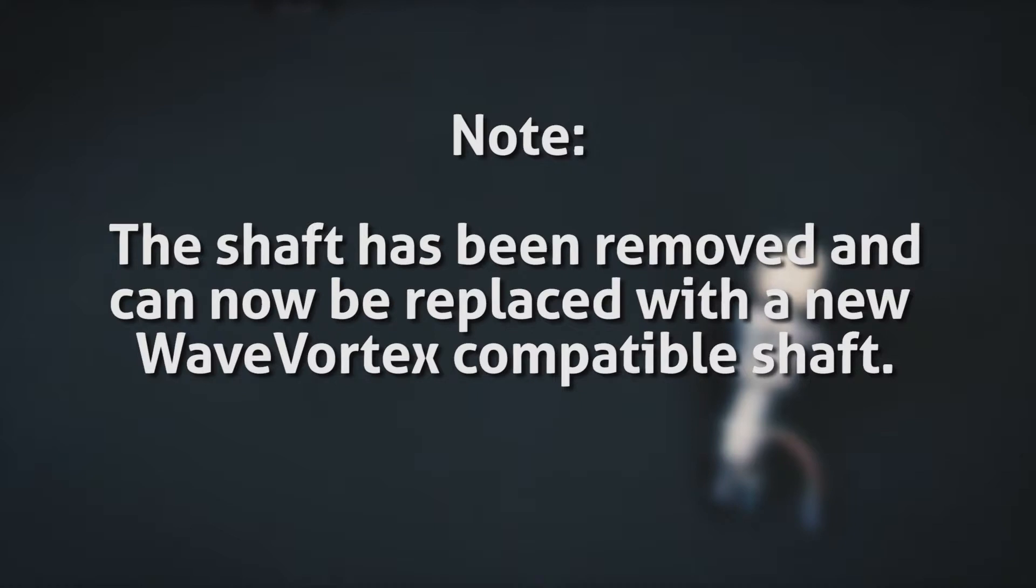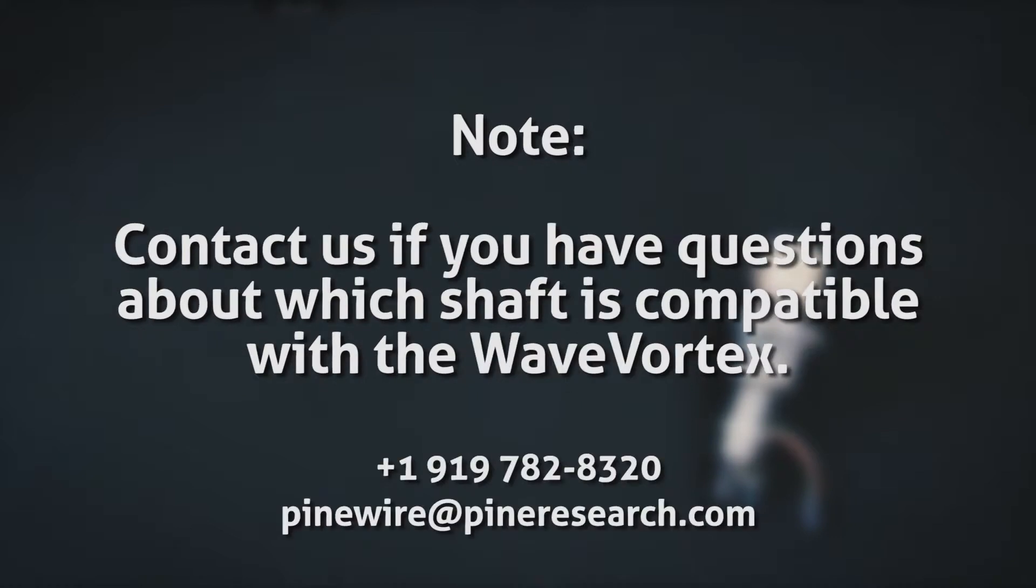Note: At this point, the shaft has been removed and can be replaced with a new wave vortex compatible shaft. Contact Pine Research if you have questions regarding which shaft is compatible with the wave vortex.